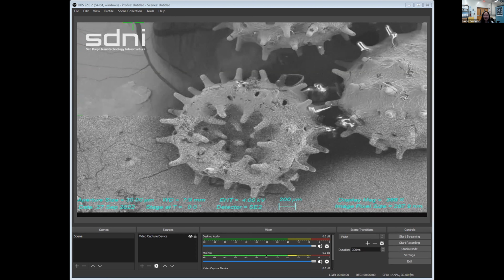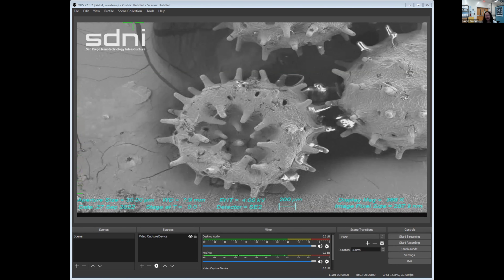And it turns out that's actually a competitive advantage that pollen has. The spikes on the pollen grains help them cling to the bodies of insects or birds, and also help them stick whenever they're being deposited somewhere else. So it's actually really smart of plants to come up with this little tactic.